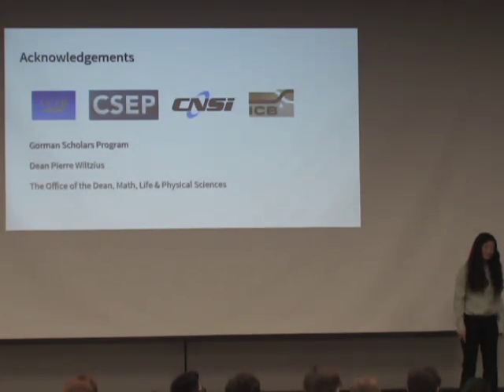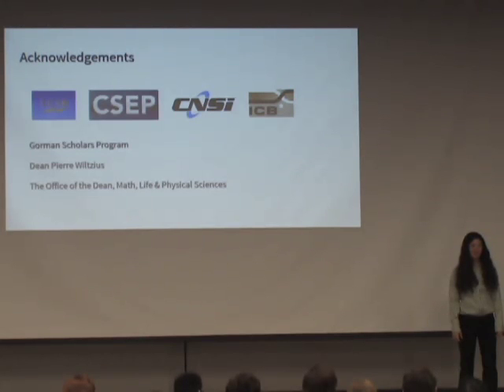And so the cost for manufacturing one of these is how much? I'm not entirely certain. Simple ingredients. It's a silicon wafer and borosilicate, so glass, bound together. Etching might be where the cost comes from. It also takes about 6 days for fabricating a new chip. I'm not sure exactly the price on it though.